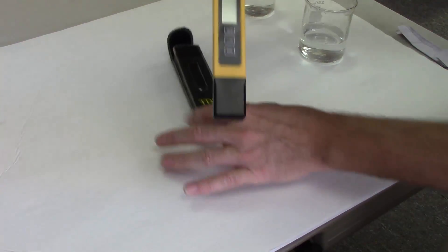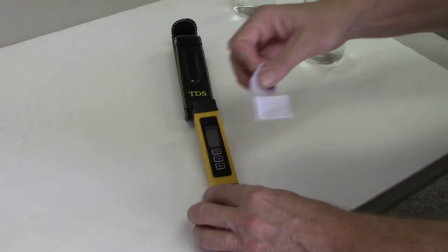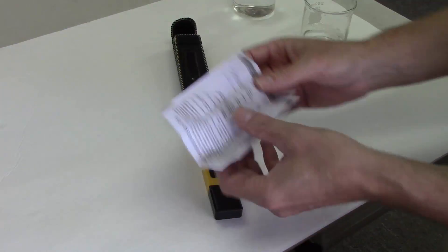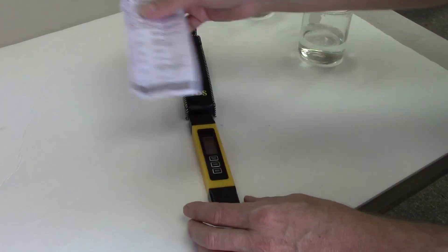When you pull the meter out of its case, inside the case there is a paper insert. The paper insert will explain all the functions of the total dissolved solids meter.